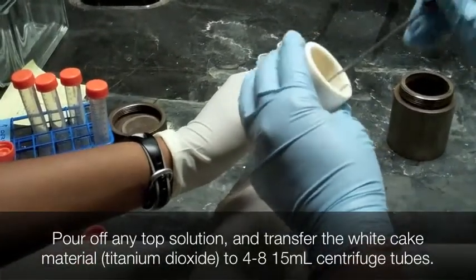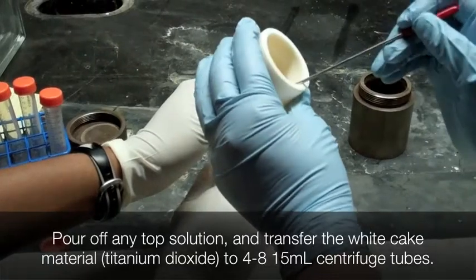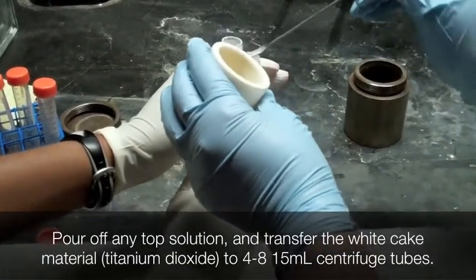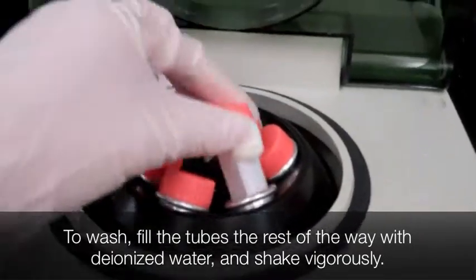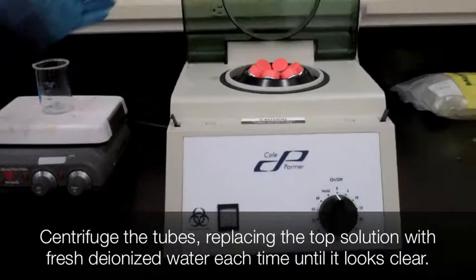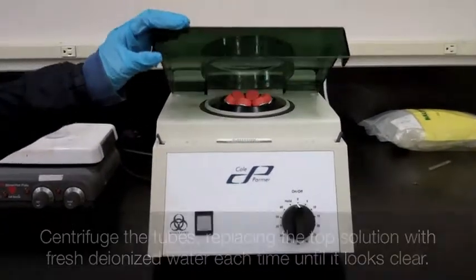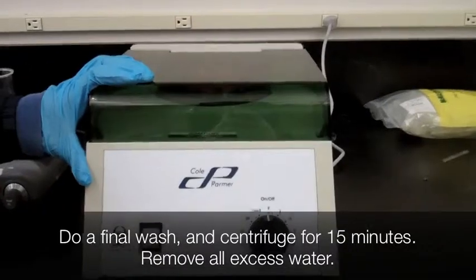Pour the top liquid from the pressure vessel into the waste container, then transfer the remaining material into five 15 milliliter centrifuge tubes. Wash the titanium dioxide by putting water in the tubes, shaking it up, centrifuging it for 3 minutes, and pouring off the top liquid. Repeat 6 to 8 times. On the last wash, centrifuge the tubes for 15 minutes.